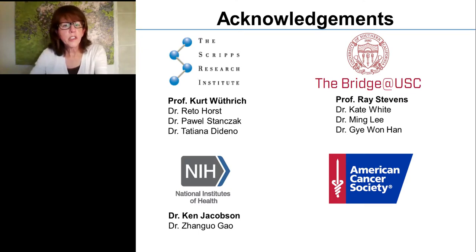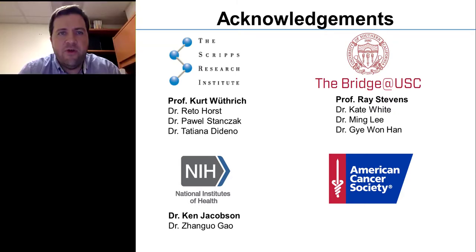The data with the A2A adenosine receptor are fantastic. How will you extend this technique to studying other human GPCRs in the future? Well, we're optimistic that the Pichia expression system can be used to express other GPCRs. There's some precedent for this in the literature where people have systematically screened the expression levels of different GPCRs in yeast or Pichia pastoris.